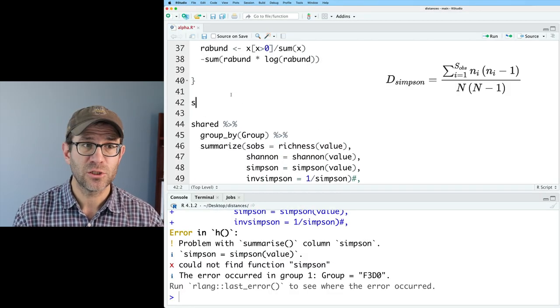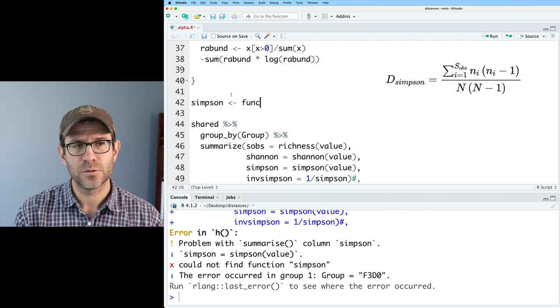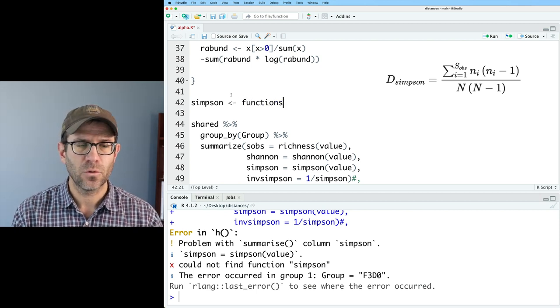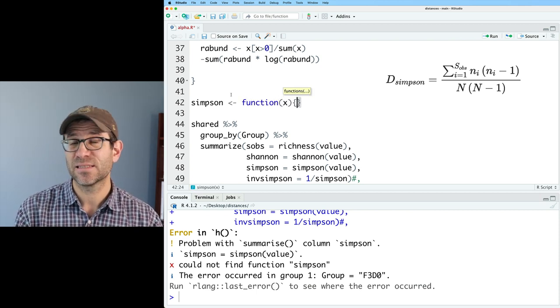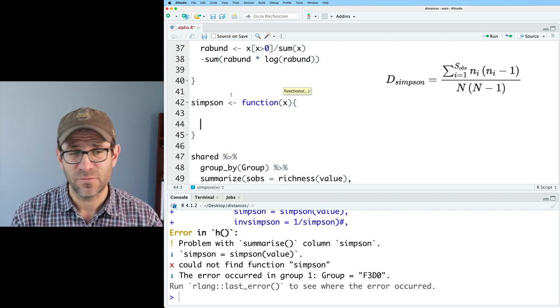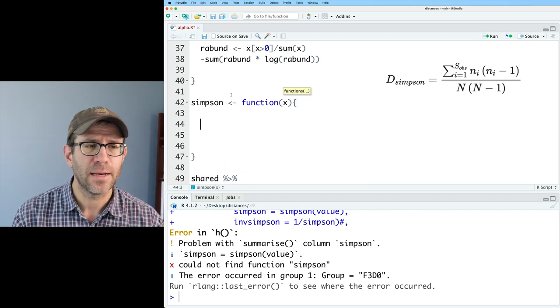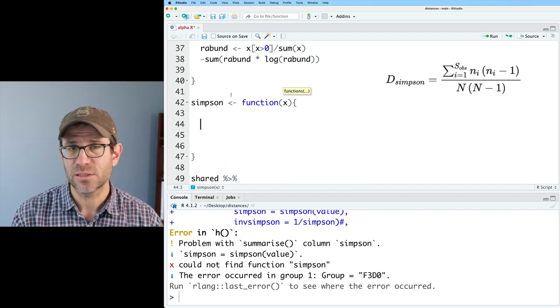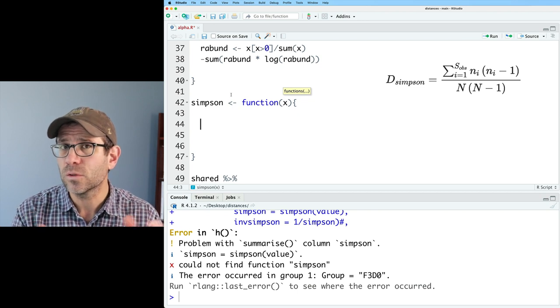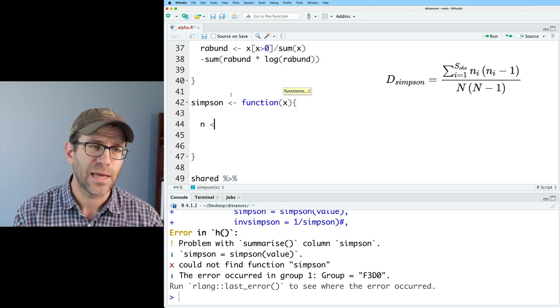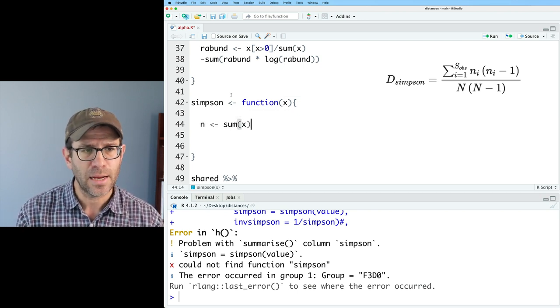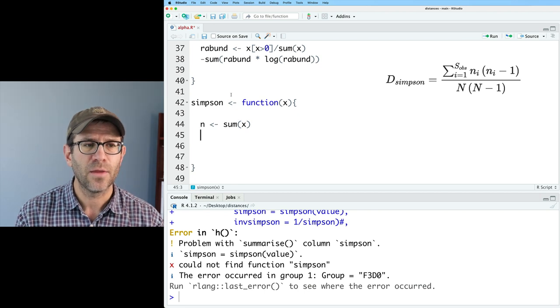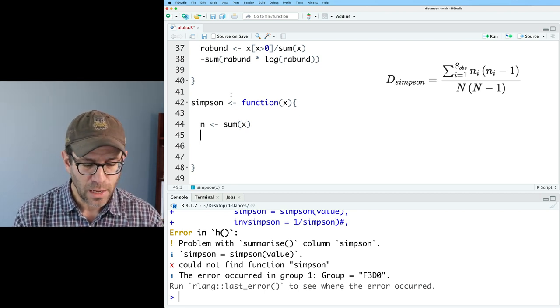So I'm going to go ahead and create my function Simpson. And I'll use the function keyword, of course, and I'm going to pass that x as my values from that value function that counts. And in my special sauce, I'm going to start by calculating the total number of individuals in x. And so I'll say n is the sum on x.